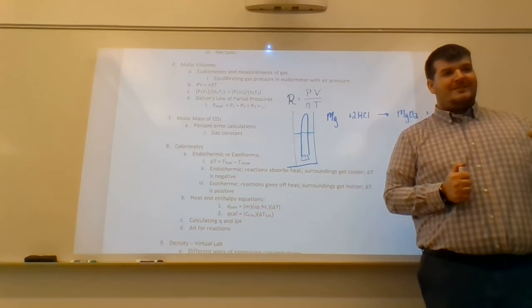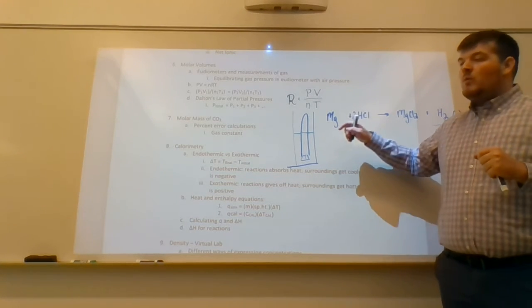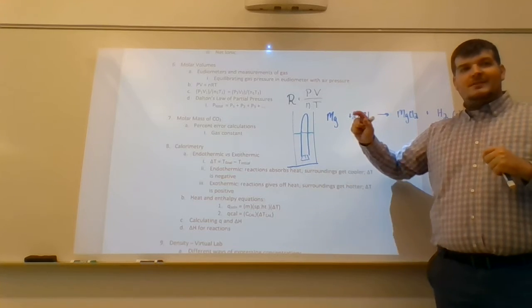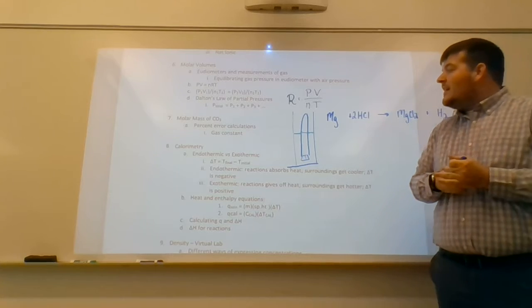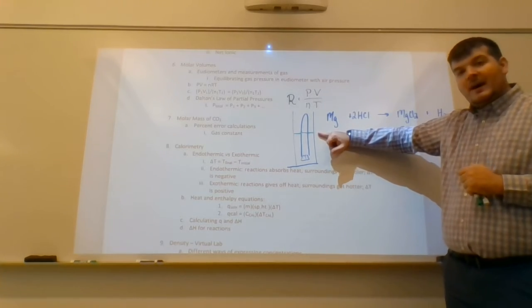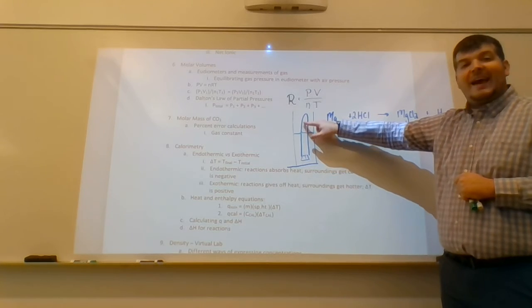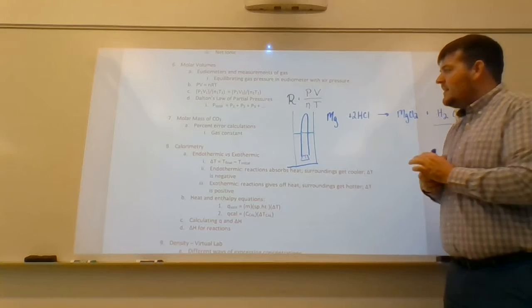Well, that's lovely, but the only way that we would know what the pressure of the gas was is if we could compare it to something. We know the value of the room pressure. If we move the eudiometer up and down to where the levels match, then the pressure of the gas inside is equal to that of the room. Let's say that this weren't the case.